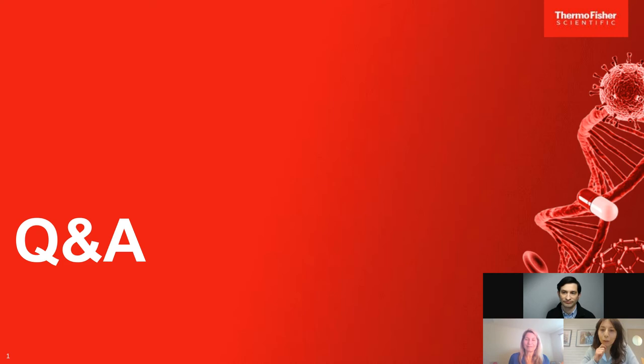I'm not sure I understood the question. I think the question maybe is, are you able to test the output of infectious viruses arising from the condition? Oh, yeah, I understand the confusion, because of course these are cryopreserved. If the viruses can still be infectious, they are. The viruses that are formed inside the cell are viruses that are released at some point, and they are infectious. Yes. Perfect. Thank you.